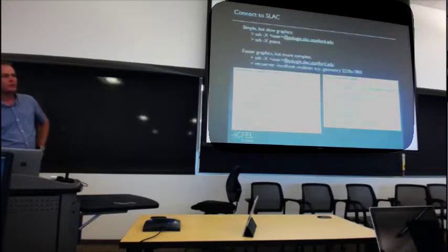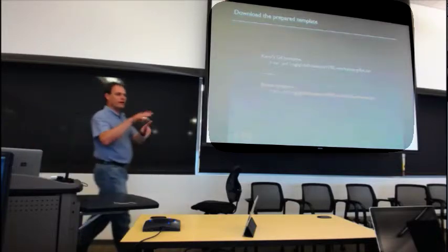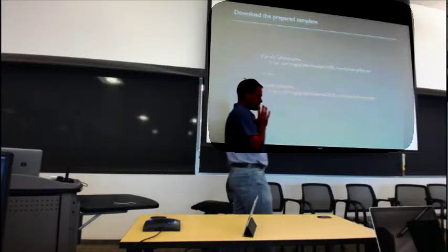First thing is log yourself on like that. Has everyone got themselves that far? Everyone's got themselves into the experiment space. Now, within the experiment space, you should mkdir your username or mkdir something. Make your own little private space within there somehow.